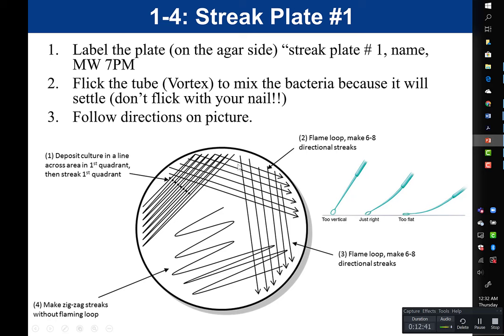The directional streaks are not zigzag streaks — you simply take your loop, touch into where the bacteria would be in quadrant one, and draw your line out. It's important that you give yourself enough space between these streaks. You don't want those lines overlapping or touching, because you'll end up with bacteria wherever these lines are, and if colonies are too close together, you won't get isolation.